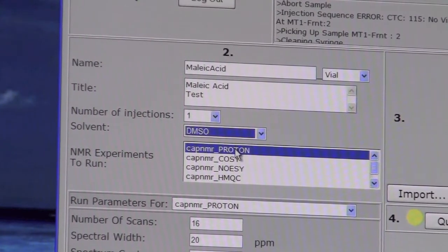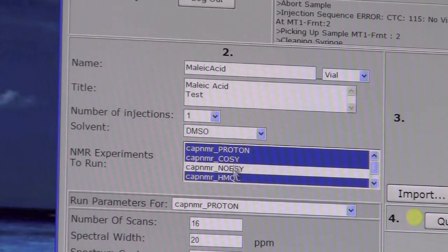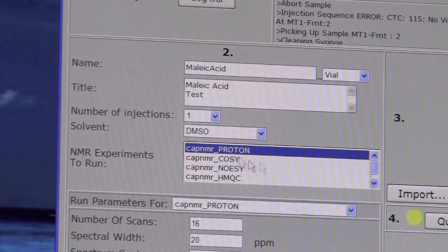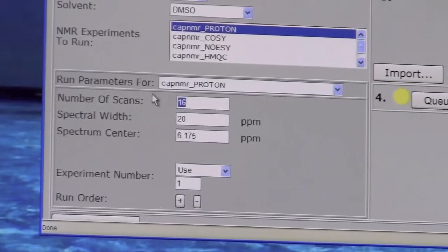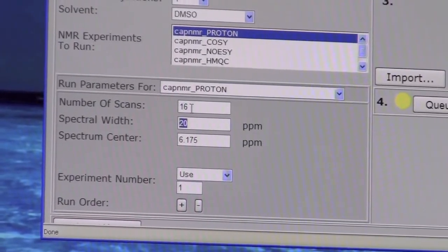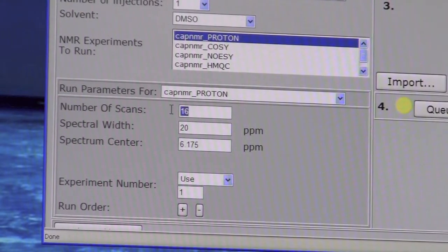And then choose the experiment. To choose multiple experiments, use control and select multiple experiments. If you just want to select one experiment, then just pick the one you want to run. To customize the experiments, pick which experiment you want to customize, and then change items about that experiment, such as the number of scans or the center of the spectrum. So if you wanted to put in more scans, you could do that here.